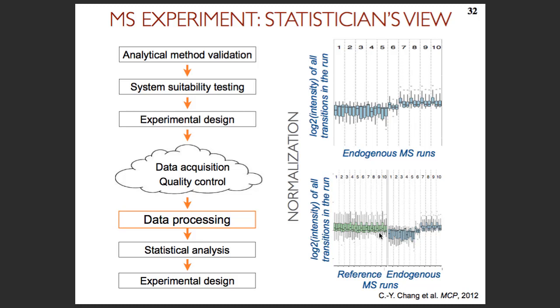I already had two types of samples where, under the condition, the overall protein content changed and also the complexity of the samples. It happened, for instance, with lung carcinoma and so on. And there you run into trouble, because depending on your normalization, the protein can be upregulated or downregulated, and then you really have to argue with other research tools that describe the protein differently. Do you have any tips for such things?